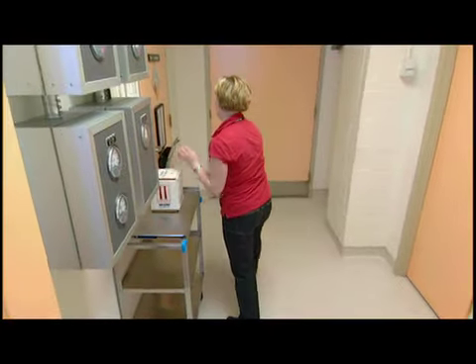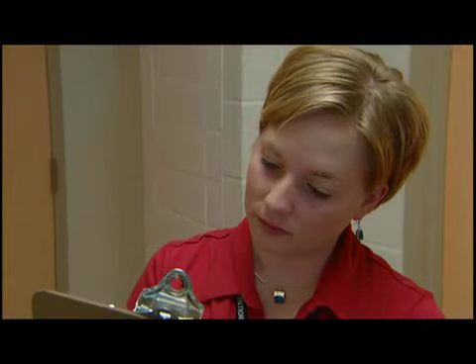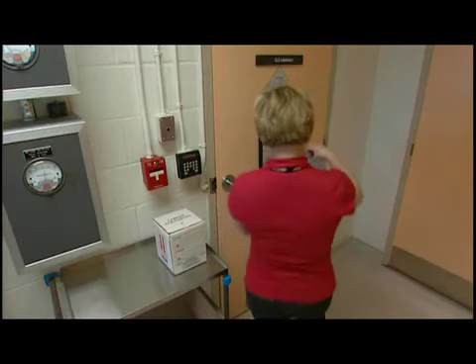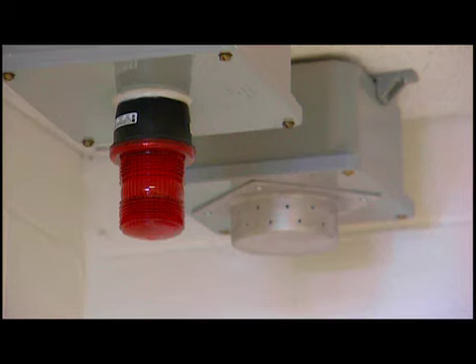Here in the anteroom is where you monitor and record the air pressure readings. Check them every time before you enter the lab. If there's something wrong with the air handling system, audio or visual alarms will warn you.